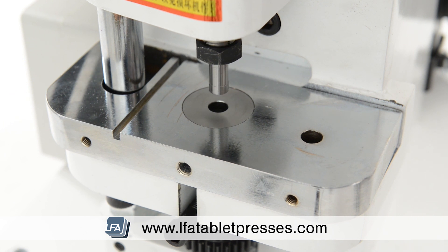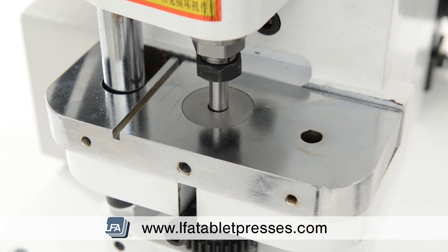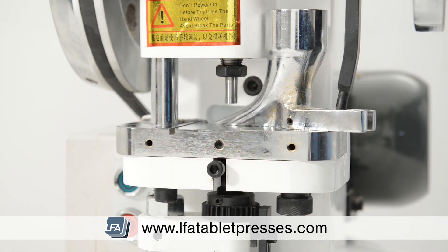For this, the boot will need to be removed. We have also removed the timing bar — whilst not totally necessary, it provides a little more access. To remove the boot, you'll first need to remove the set screw on the side using an allen key, then remove the boot bolt and spring by hand or with grip as needed.